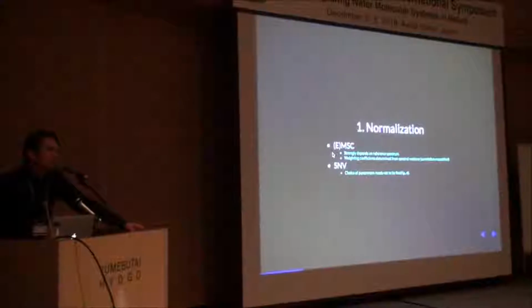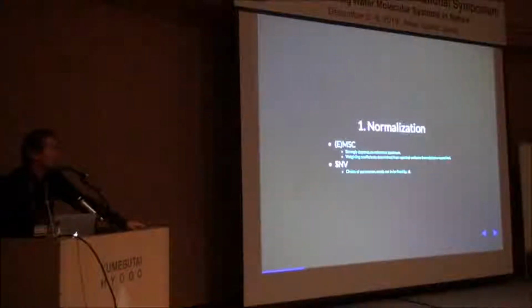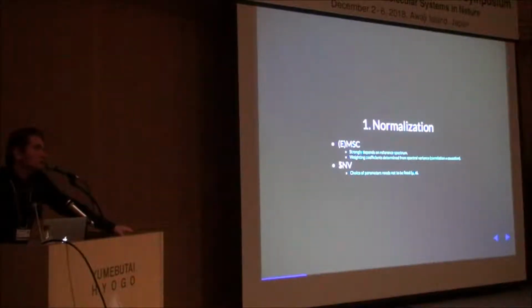My experience is that EMSC doesn't differ, and a lot of people can agree with that, as far as liquid samples go, with moderate to low concentration. EMSC and MSC do not perform dramatically differently in terms of prediction accuracy when compared to SNV.